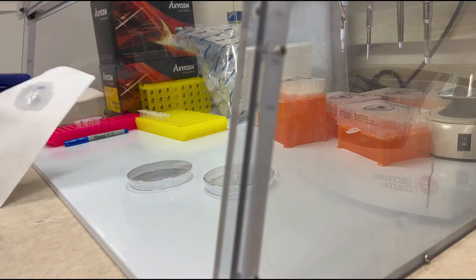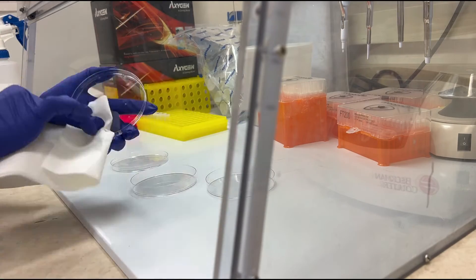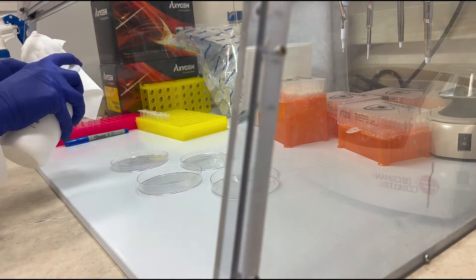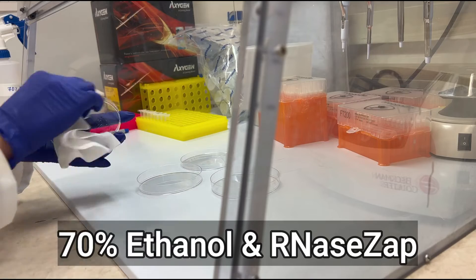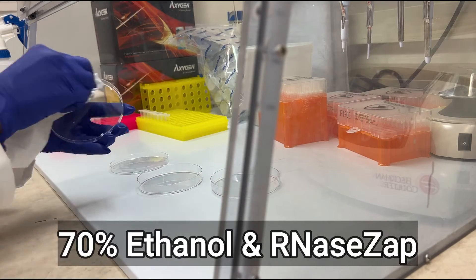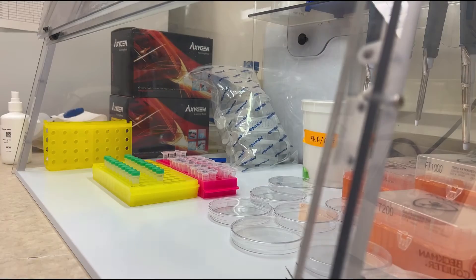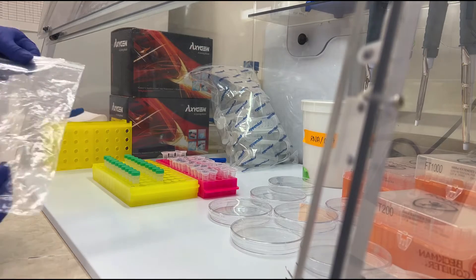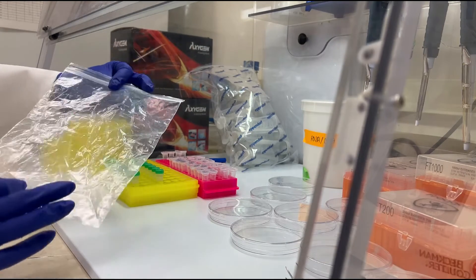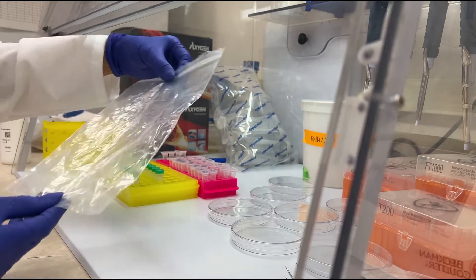Don't forget about your petri dishes or any other surface you want to use for cutting the tissues. Wipe them down with 70% ethanol and RNA zap to maintain a clean workspace for your samples. Lastly, grab a bag for dry ice—this will come in handy during the cutting process.